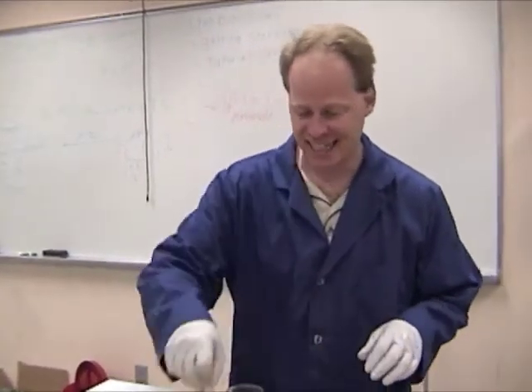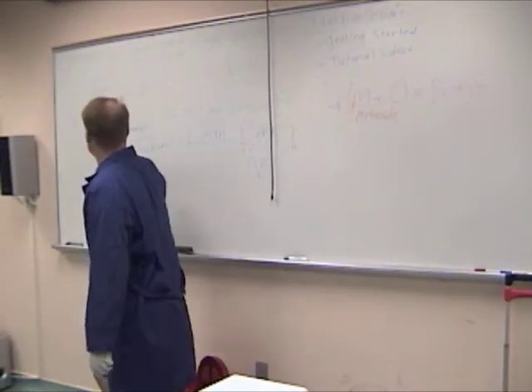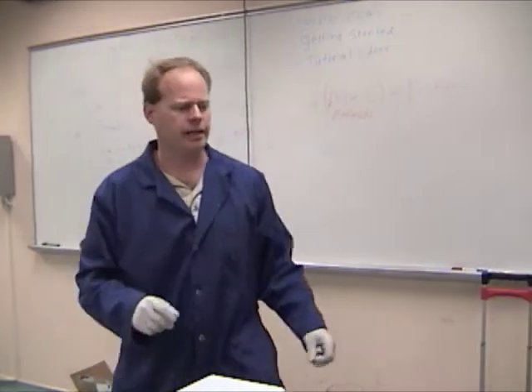I'm not perfect. Okay, so now I have everything ready to do my titration. Now I'm going to start putting in measured amounts of this. We need to add a couple drops of phenolphthalein.